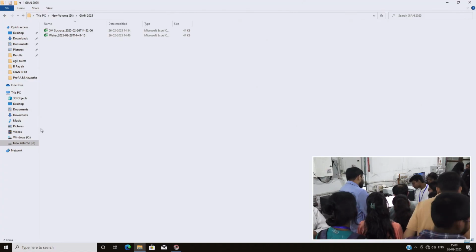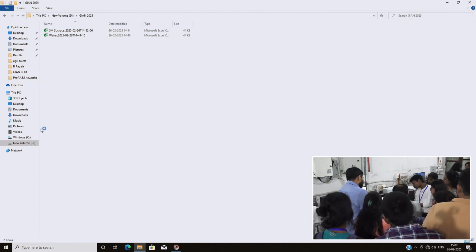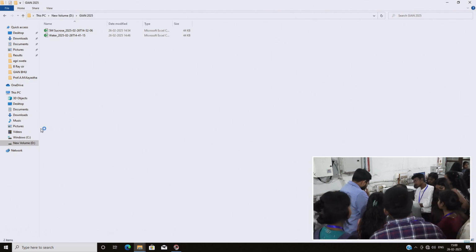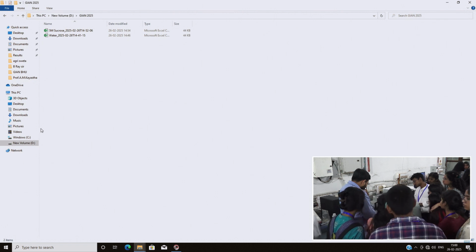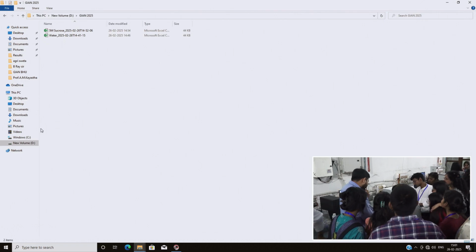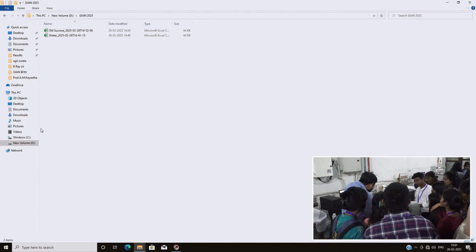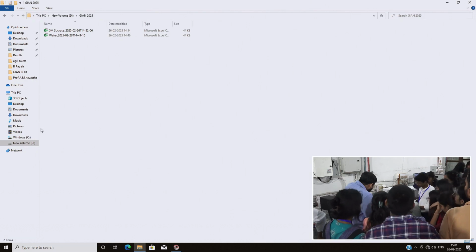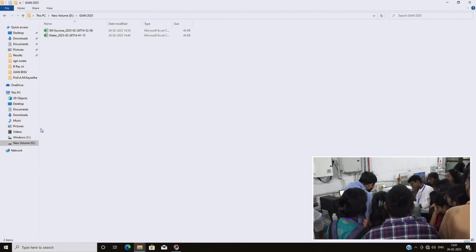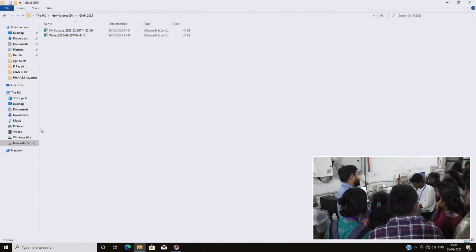So this is a different spectrum, and the axis is separate. You see, this is the absorption transmittance spectrum of sucrose. Okay.